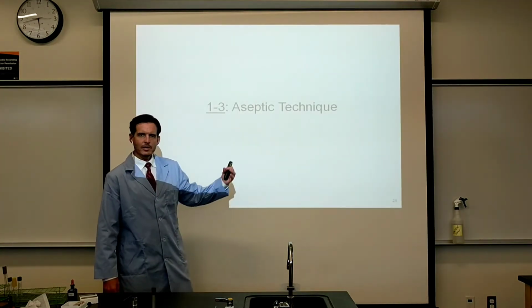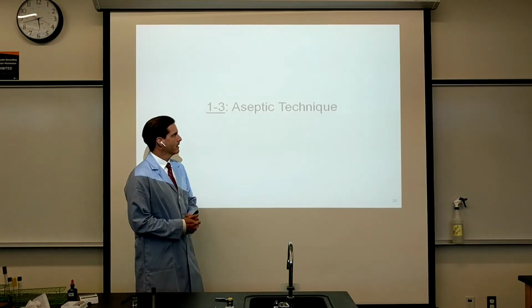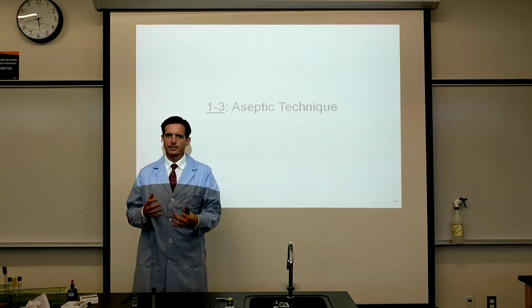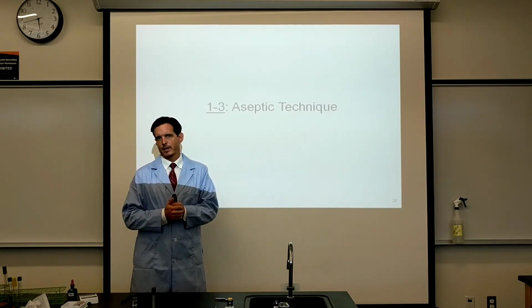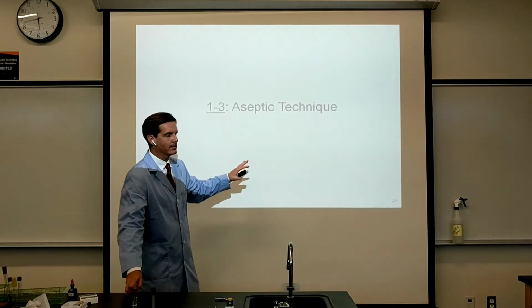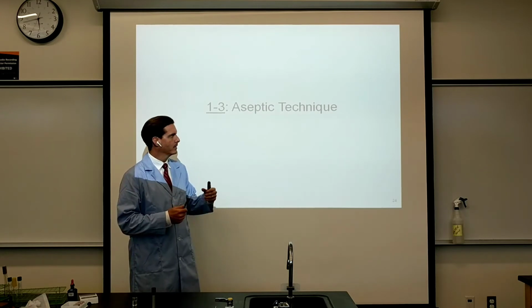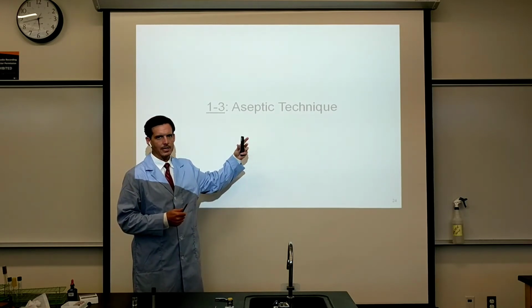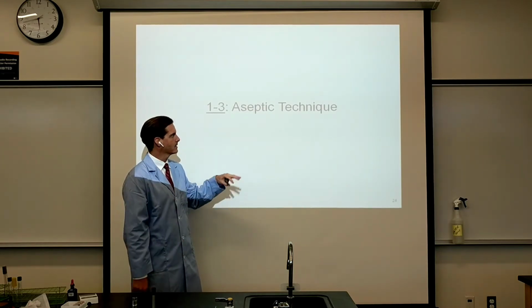Guys, how about aseptic technique? Aseptic technique is an essential hands-on technique that may be the biggest reason why you take microbiology lab. We need to learn these words and then go through the motions of learning how to keep ourselves free of contamination and to not contaminate our equipment or anyone around us.